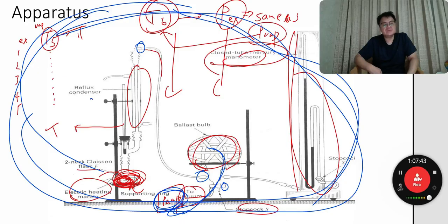If these connections are not really vacuum tight and you have many leaks there, then you're not going to get that low pressure. So in order to get to something like 90 or 80, even 70 millitorr, quite low pressure, by evacuating the whole system with the vacuum pump, the whole system should be quite tight so that you don't have that many leaks, okay?